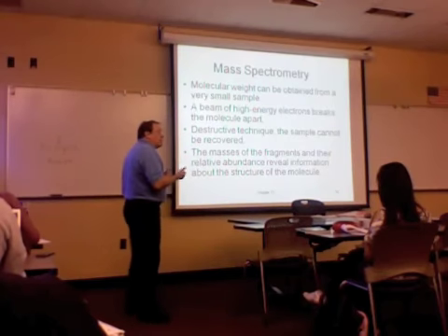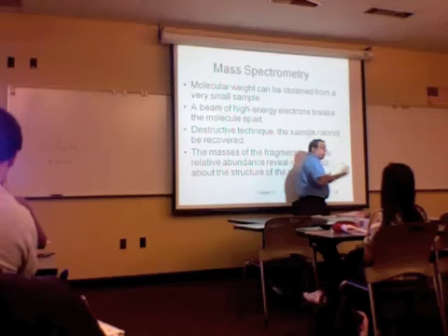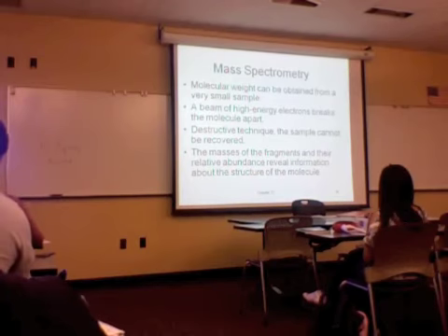You'll take an unknown compound and inject it into a GCMS, that's a coupled gas chromatograph mass spec system. Those systems will analyze the sample and do a computerized report. They don't require any brains on your part at all, other than being able to stick a syringe in the instrument without jabbing yourself.